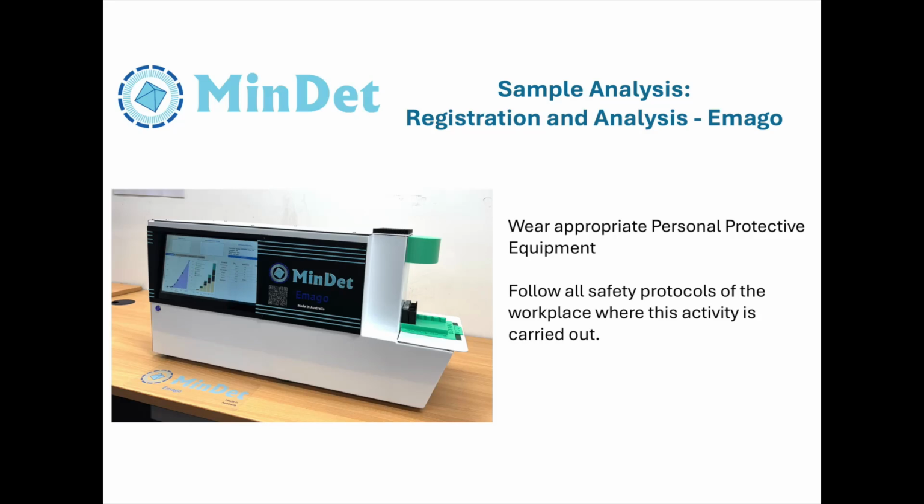This video explains how to register and analyse samples using the Emago device. Please ensure that you are wearing the appropriate personal protective equipment and follow all the safety protocols of the workplace where the activity is carried out.